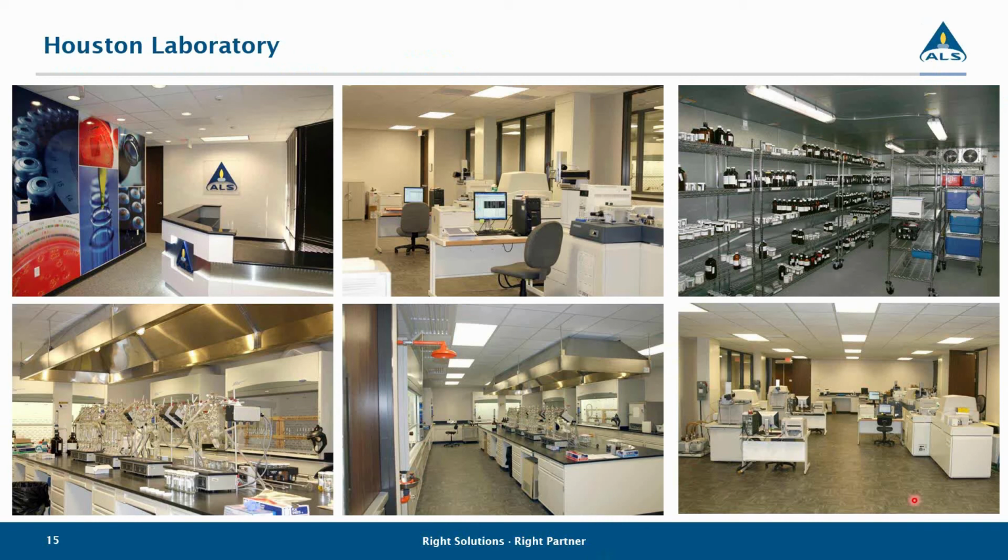Well, the J flags typically are only used for our analysis when it's an estimated value, when the result falls between the EDL, that's the estimated detection limit, and the method reporting limit, and that's where you see your J flag data. That doesn't really have anything to do with the Y flag, which is the labeled standards. When the labeled standards, that's the spike that we put into the sample, come back a little low, it means you lost some.